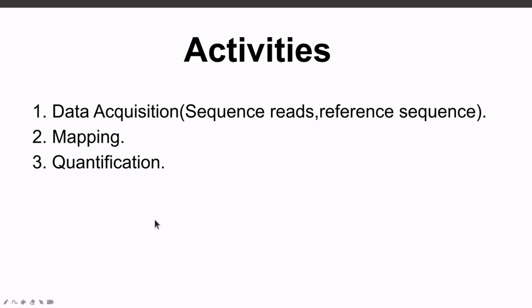Please take note that these three activities are part of a bigger workflow that is used for RNA Seq data analysis. And so this means that there is more to what I've indicated here when it comes to RNA Seq data analysis. But the focus of this tutorial is to show you how to quantify the reads, and that is why I have limited the activities to these three. Okay, so that's what you need to know.